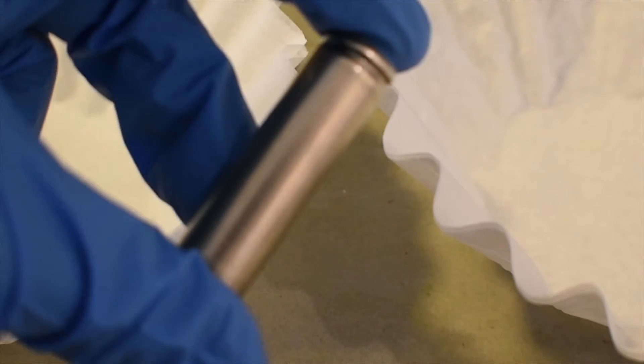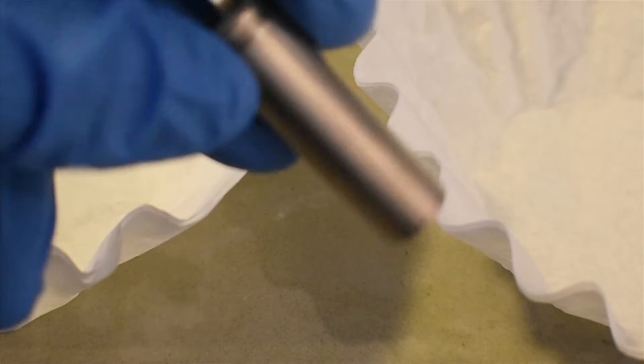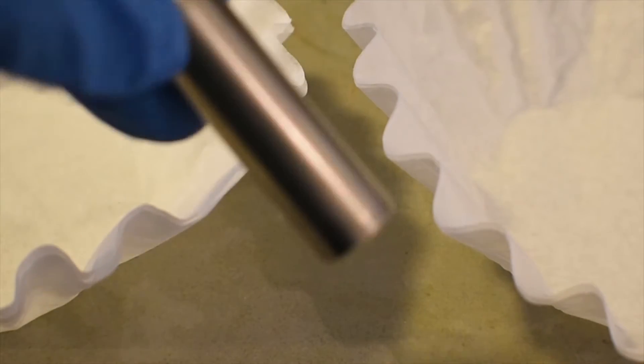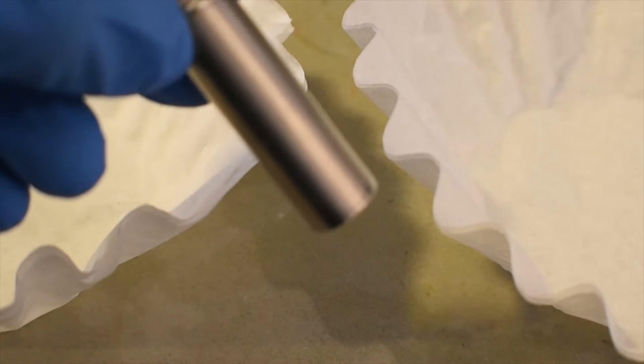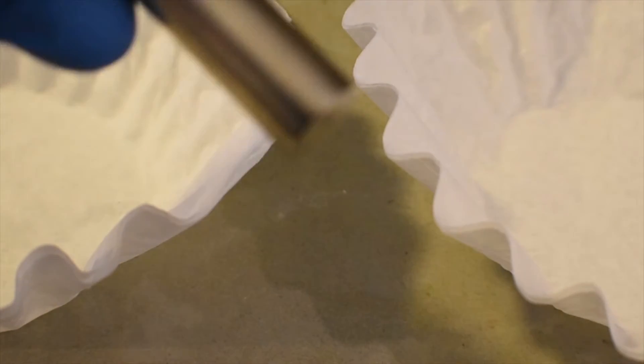Hey everyone, welcome back to another video. Today we're going to be extracting cadmium out of a NiCd battery. I've never really seen a definitive extraction of cadmium from anything on the internet, so I thought I might be the first one. What we have here is a NiCd battery — one of three that was in a phone battery I bought at a hardware store. Make sure it's not NiMH or nickel metal hydride, because that has absolutely no cadmium in it and is useless for this purpose. You need a NiCd battery.